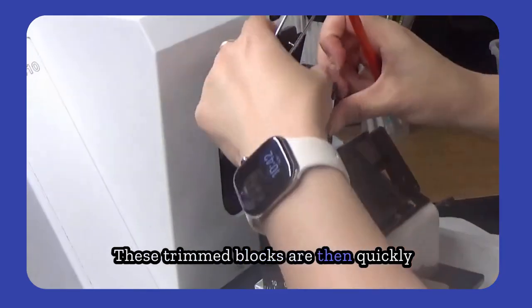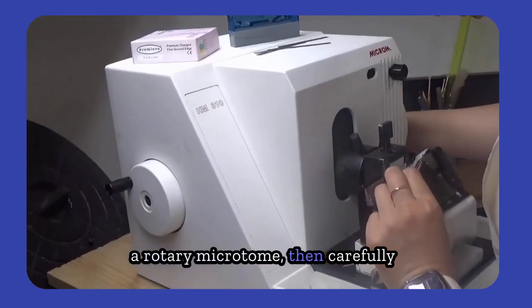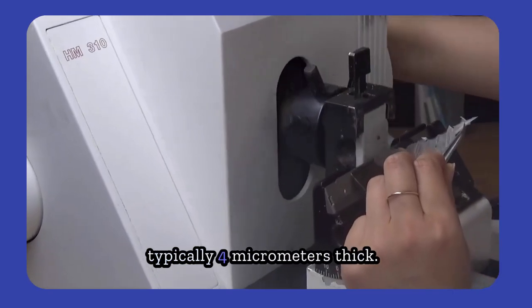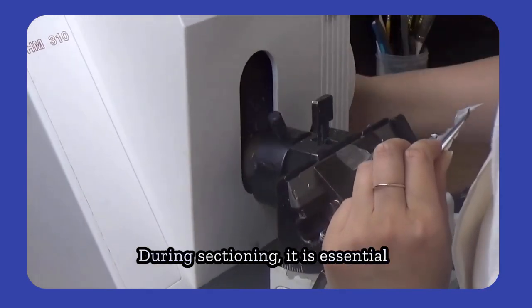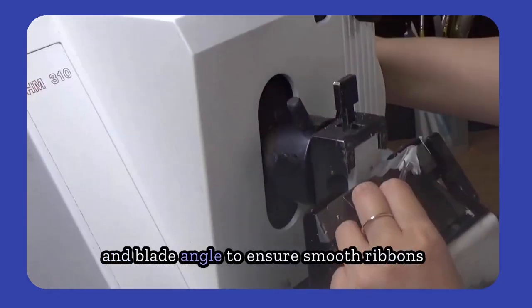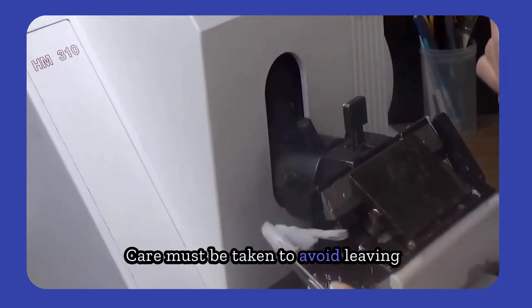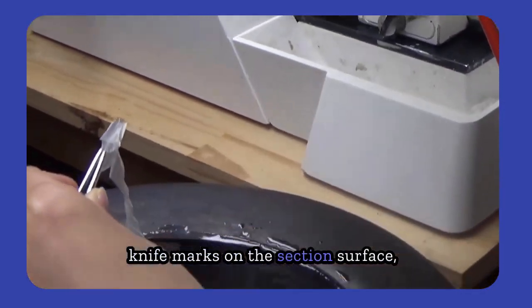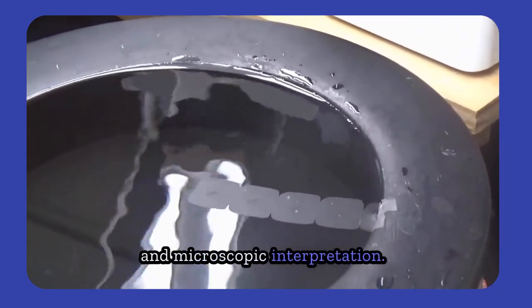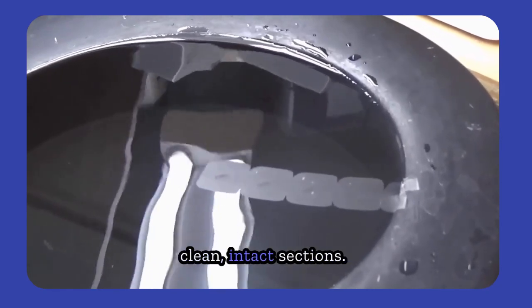These trimmed blocks are then quickly sectioned to expose the tissue using a rotary microtome, then carefully sectioned to produce thin tissue slices, typically 4 micrometers thick. During sectioning, it is essential to maintain a consistent cutting speed and blade angle to ensure smooth ribbons without compression or chatter. Care must be taken to avoid leaving knife marks on the section surface, as this can compromise staining quality and microscopic interpretation. The blade should be sharp and free of residue to achieve clean, intact sections.